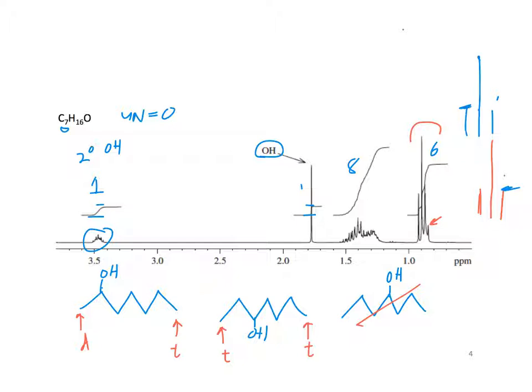So I think what it actually is is this triplet like this with a doublet overlapping like this. That's what I was wondering, because that makes this middle one a lot taller than the one on the outside. And then they're overlapped in the middle, so that's the biggest peak, because it's a doublet and the edge of a triplet overlapped.